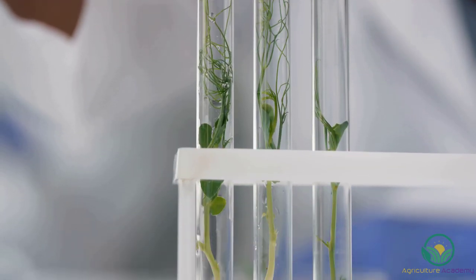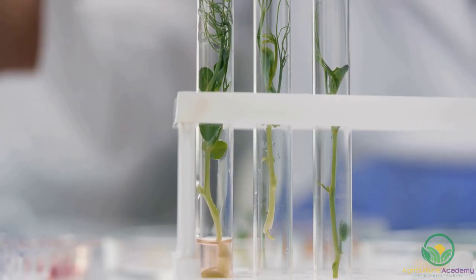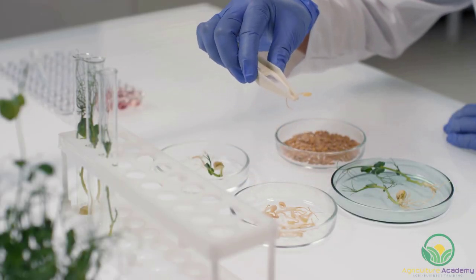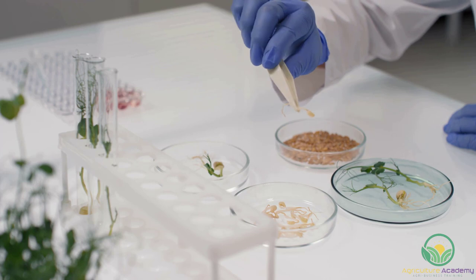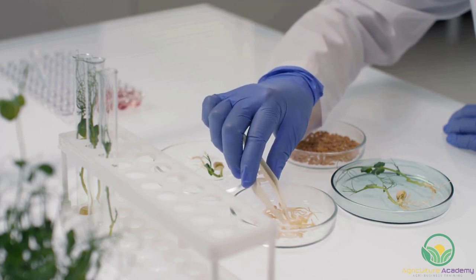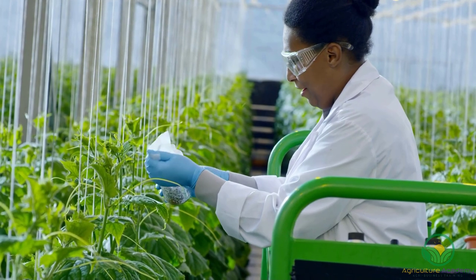These five stages are: stage 0, donor plant selection; stage 1, establishment and stabilization; stage 2, shoot multiplication; stage 3, root formation; and stage 4, acclimatization. In this video, we are only going to detail stage 1 of this process, but here are some brief details about the other steps.